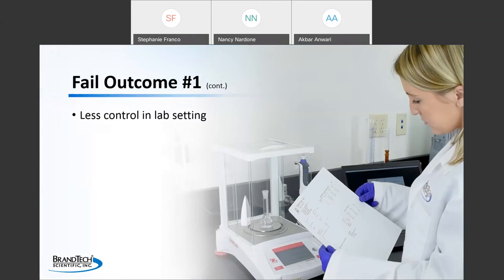So while the individual performing the testing followed the testing instructions to the best of their ability, they were only capable of controlling certain factors. Some of the factors to be recorded on the test record that I didn't point out were environmental conditions, such as air pressure and relative humidity, conditions that can vary and are not tightly controlled in a standard lab. A quality calibration facility will control for these conditions.